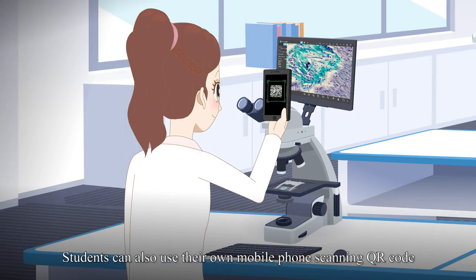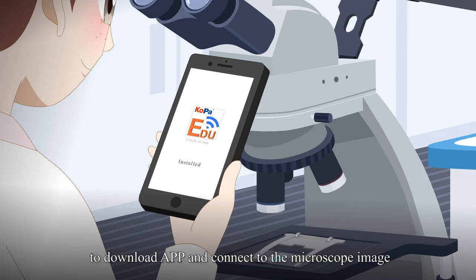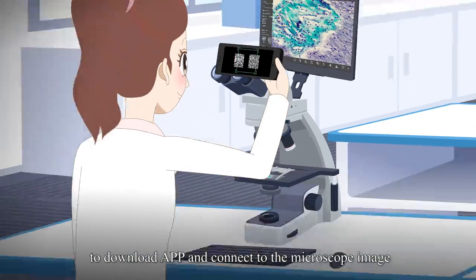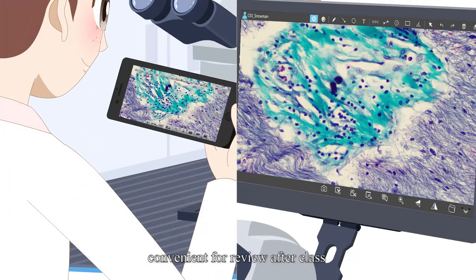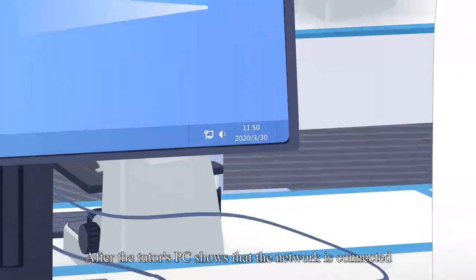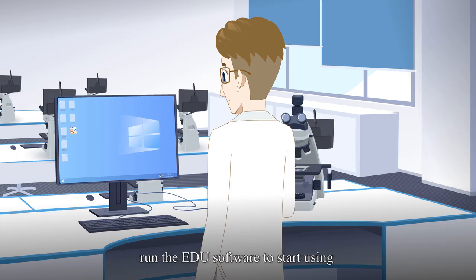Students can also use their own mobile phone, scanning QR code to download APP and connect to the microscope image. Images and videos can be saved to mobile phone, convenient for review after class. After the tutor's PC shows that the network is connected, run the EDU software to start using.